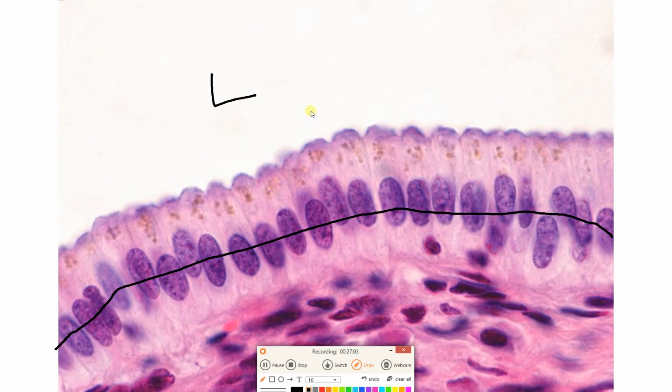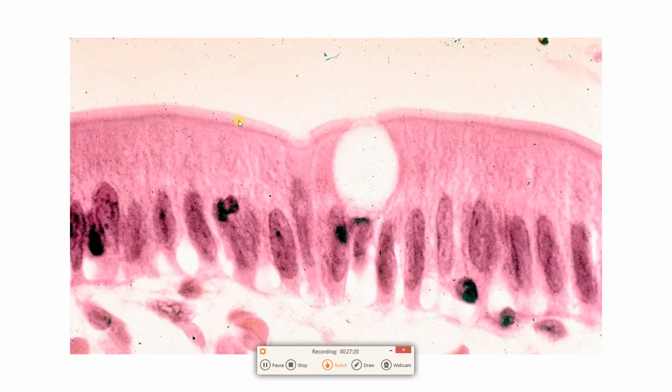Now, this apical surface, what would you find here? You would find microvilli. Now, what's absent here? They're just not in this particular stretch, but goblet cells. And of course, what do goblet cells do? Goblet cells make mucus. But look at this picture. This is an amazing picture.